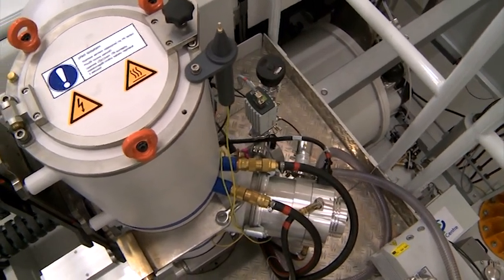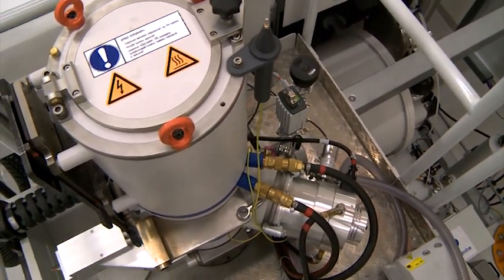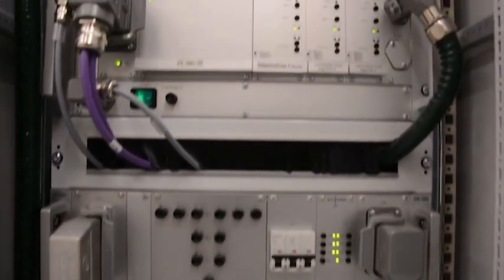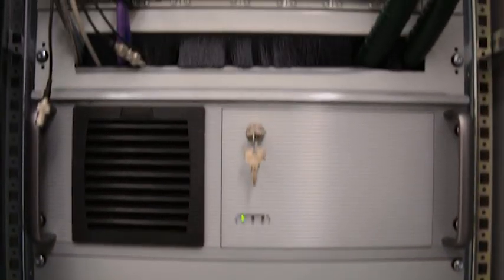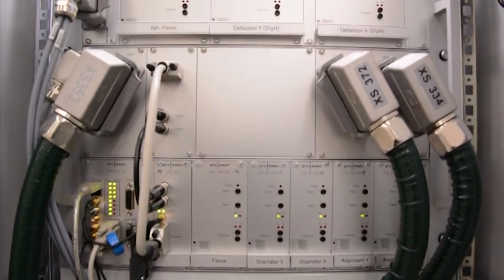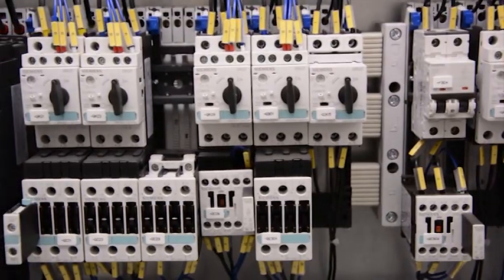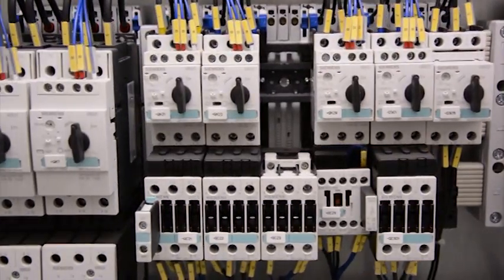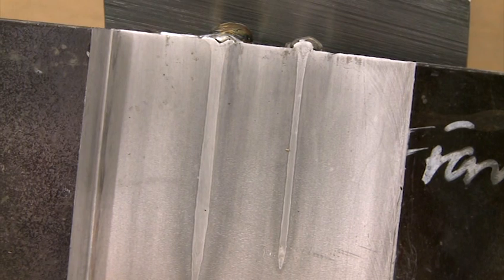Jako zdroj paprsku nám slouží elektronové dělo, které je napájeno vysokonapěťovým generátorem o napětí 60 až 150 000 V s maximálním výkonem 15 000 W. Paprsek o takovémto výkonu je schopen snadno proniknout i více než 10 cm ocely.